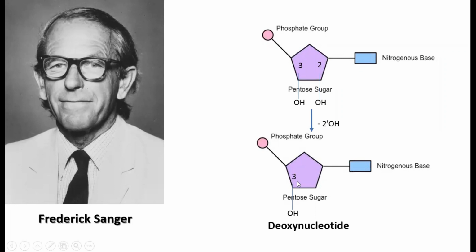The nucleotide already present in your DNA has a 3' OH group extending out, which is freely available. When a new nucleotide comes in, the lone pair on this oxygen can go and bind with the alpha phosphate group. This phosphate group consists of three phosphates, P1, P2, and P3. So this OH group can go and bind over here, and that's how the process goes further.